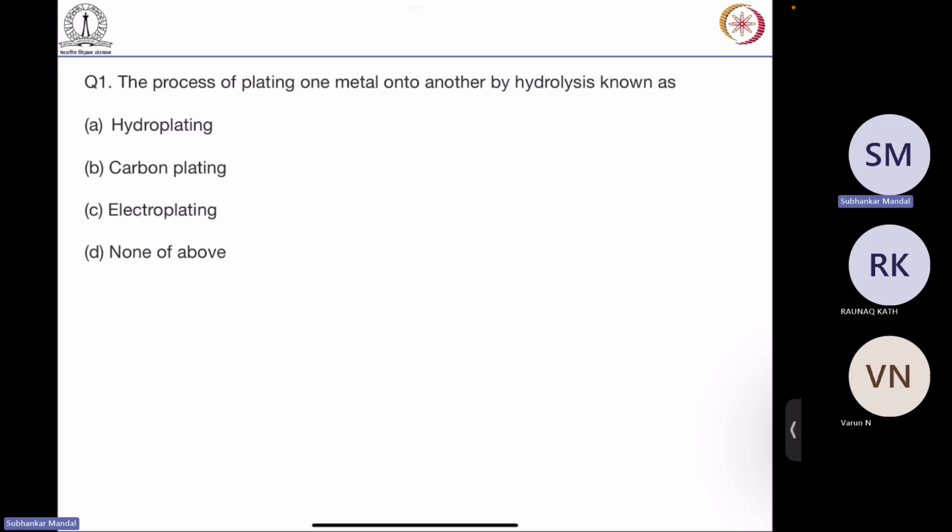So the cyclic voltammetry part, is it clear? If anything is not clear, you can ask the question now, or you can ask at the end also. Now in our research, all people used to do cyclic voltammetry, which is the primary tool to know if some redox peak or some redox active species is there. That is the first thing we used to do.